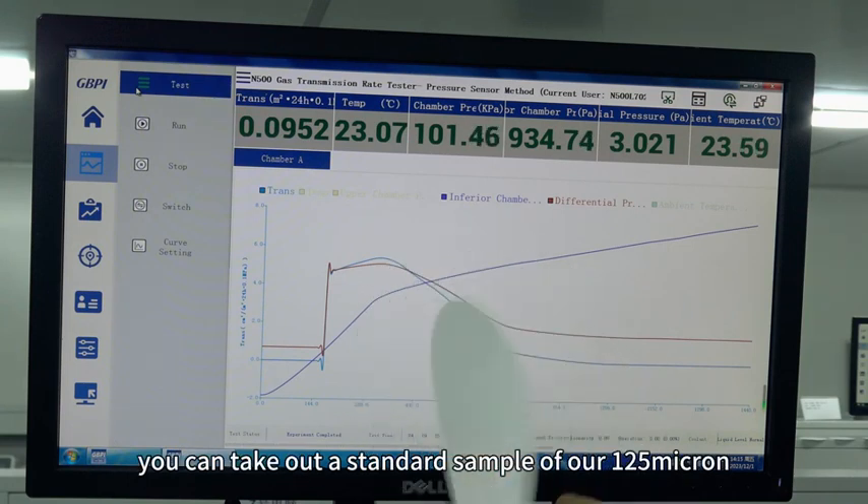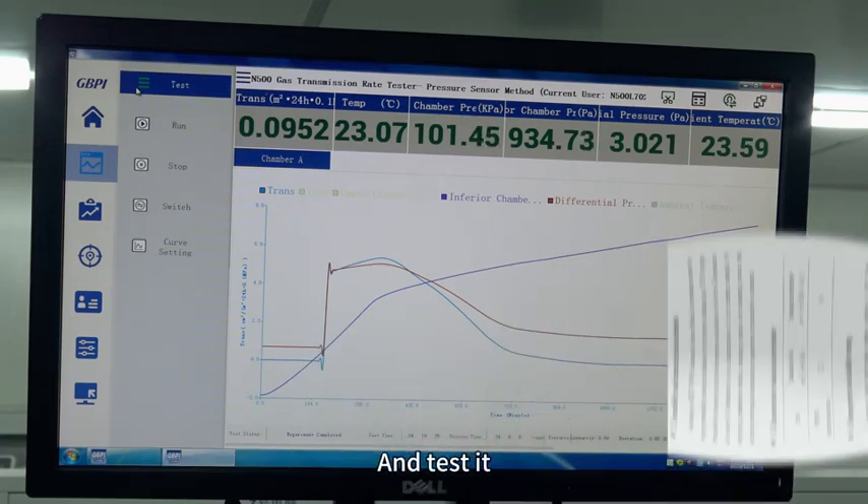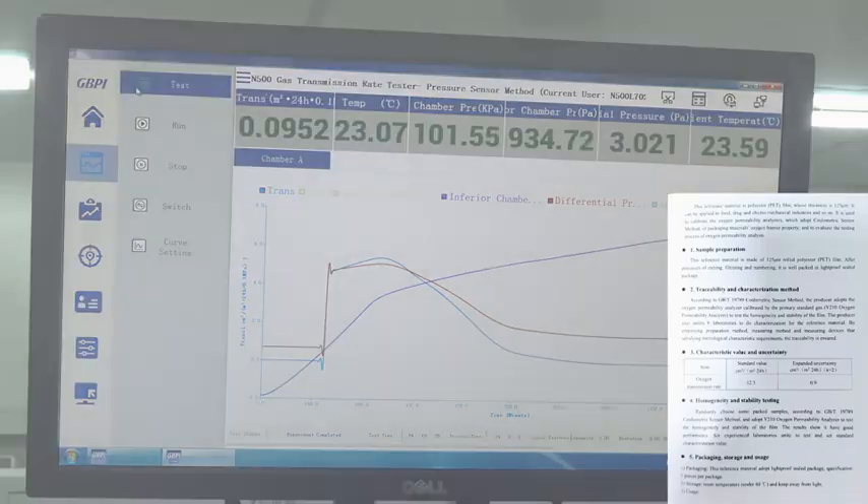If you want to verify the accuracy of the instrument, you can take out a standard sample of about 125 microns and test it.